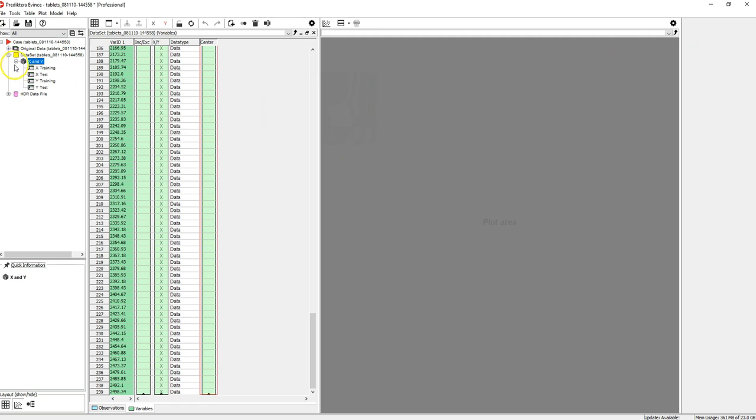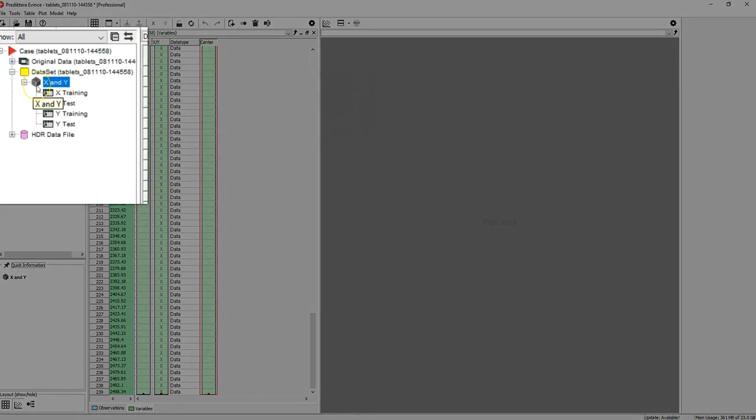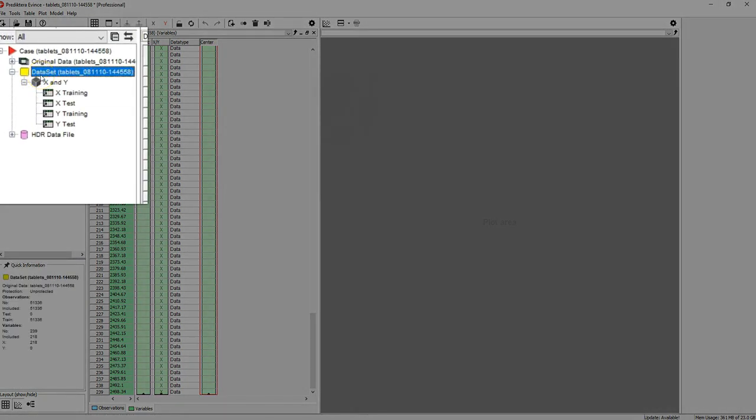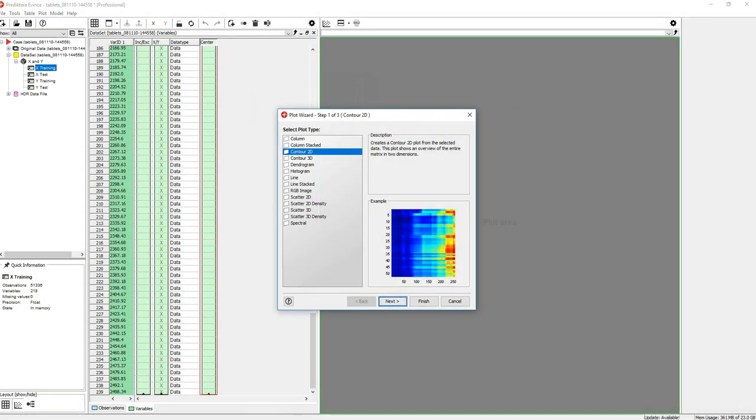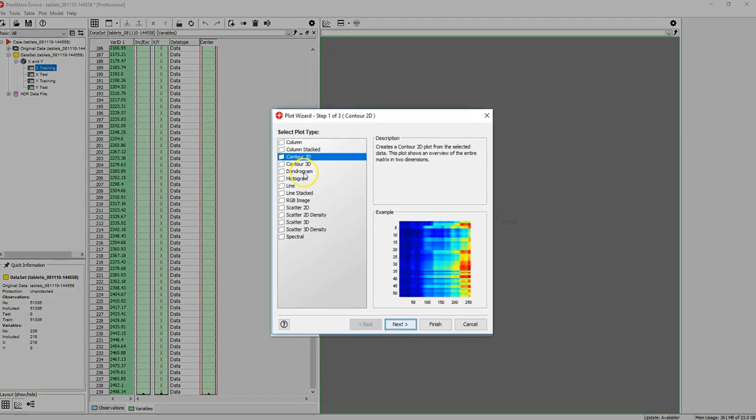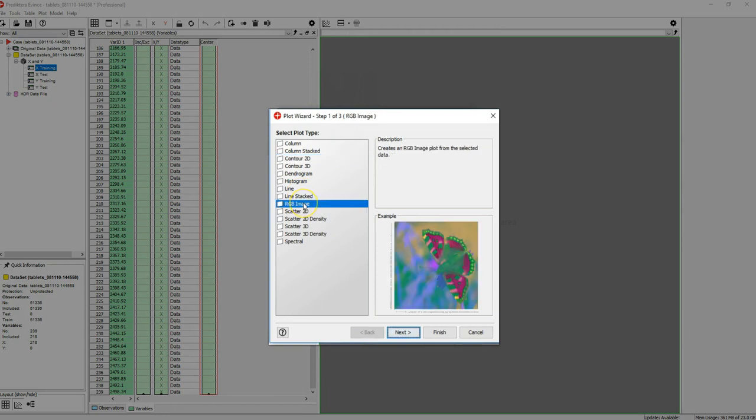In the data tree you will find the dataset for the imported image file. Drag and drop the X training to the plot area and then select to generate an RGB image.